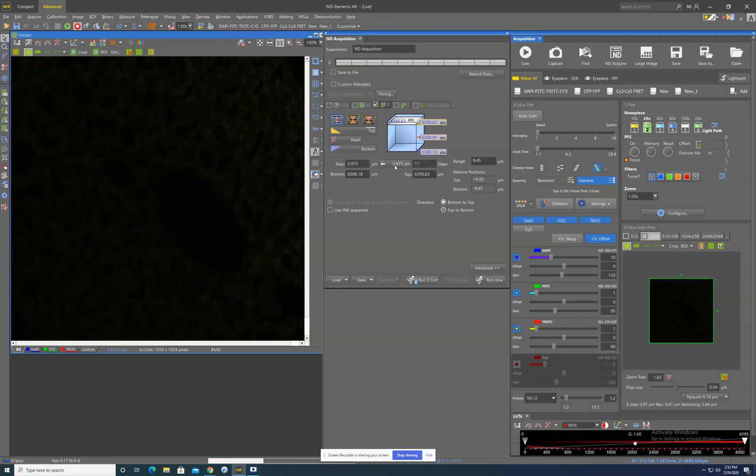So optimally, based on what you would like to image within and the live working setting that you have, it tells you that you should take an image every 0.975 microns and you will end up with 11 pictures. This is a great place to start. You probably would always want to hit this button even if you know that you don't need optical sectioning that is that precise.